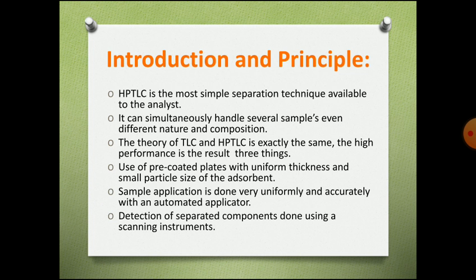Detection of separated components is done using scanning instruments.